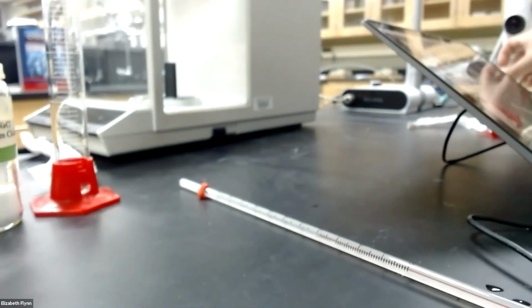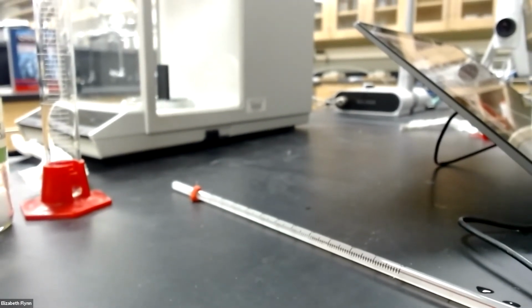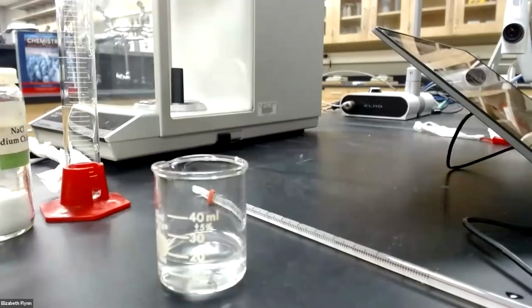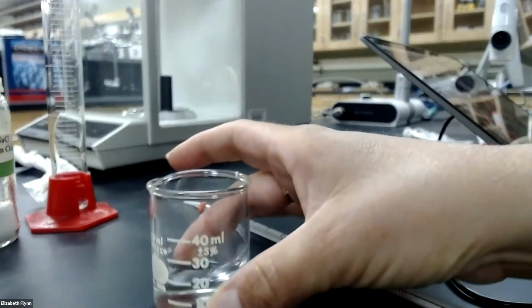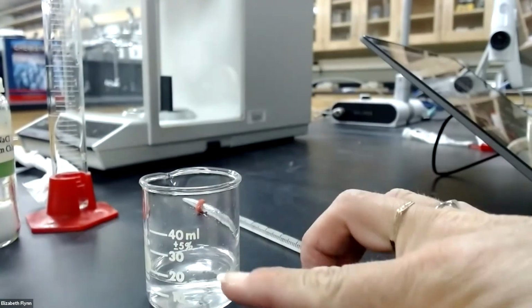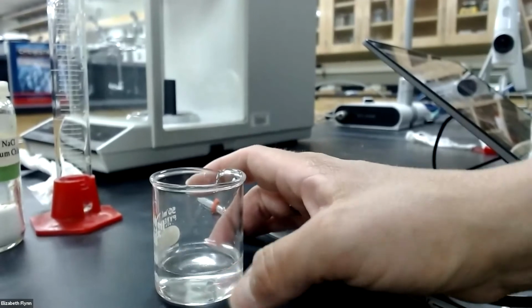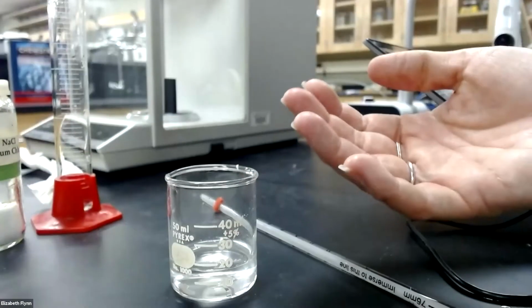At that point you should have a nice and dissolved saline solution. I don't have the full volume anymore because I've used some already, but you should have a nice clear solution after you've microwaved it twice and stirred it. All right, so that's what I'm going to work with now.